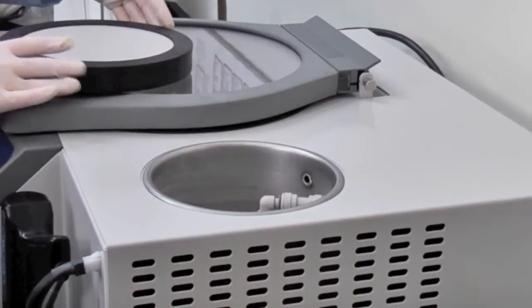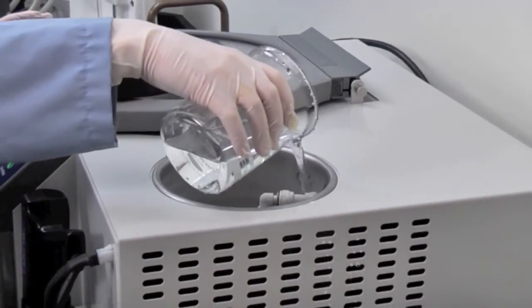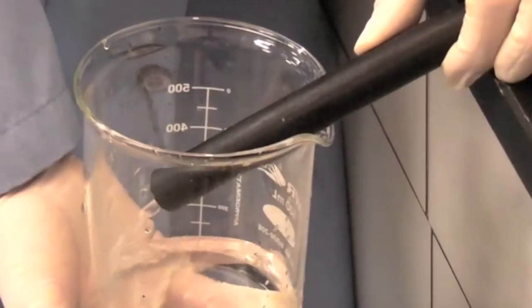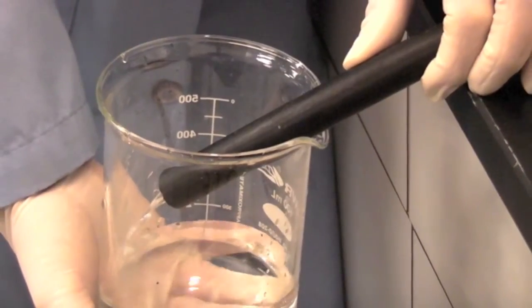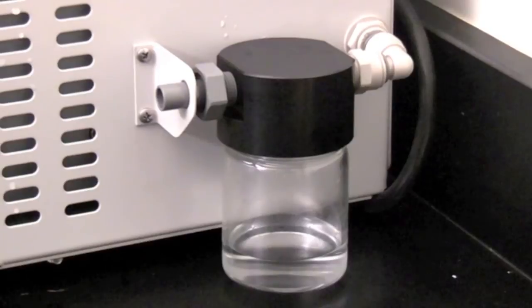Defrost and drain the cold trap, making sure to close the port after draining. Check the vacuum pump exhaust trap and empty if necessary.